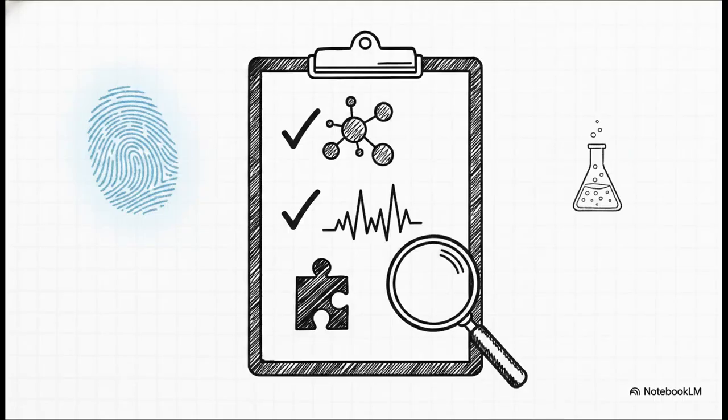So the crucial takeaway here is that you need a systematic approach, a kind of forensic checklist. First, you inspect the molecular ion cluster. Then, look at the high mass peaks and determine if the mass losses are odd or even. Odd mass losses usually point to simple, homolytic single-bond cleavages. Even mass losses, those are the ghostly fingerprints of rearrangements and eliminations, like our good friend the McLafferty rearrangement. Finally, you scan for distinct structural fragments.